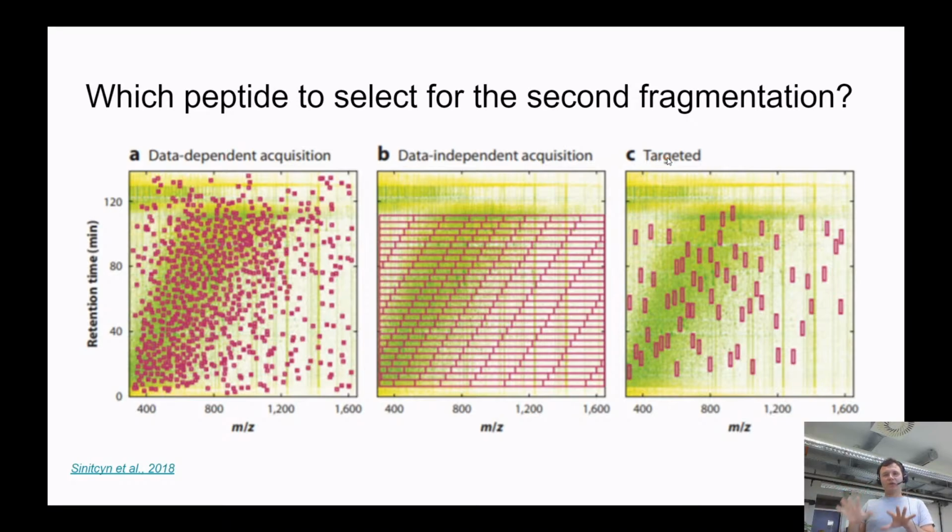Imagine a situation which is actually very typical in medical research. Let's say you had breast cancer samples, and it's well known in the field that you can approximately clusterize all patients' breast cancer into 4 groups, and they have some specific pattern of expression. And let's say we measured, say, 1,000 samples, 250 samples in each group.